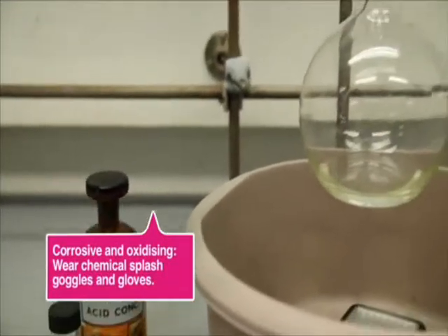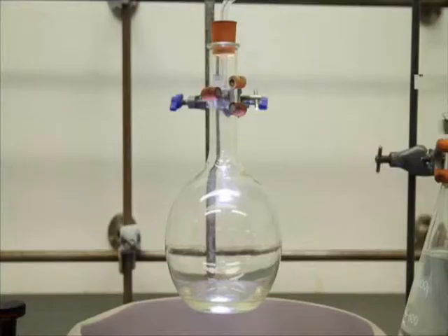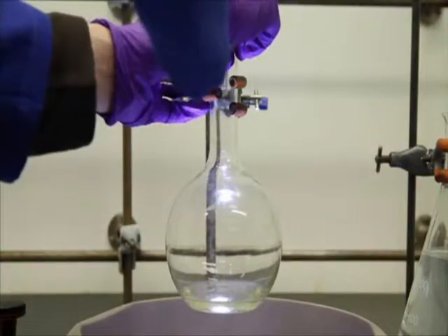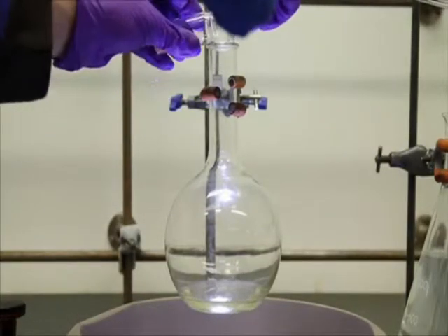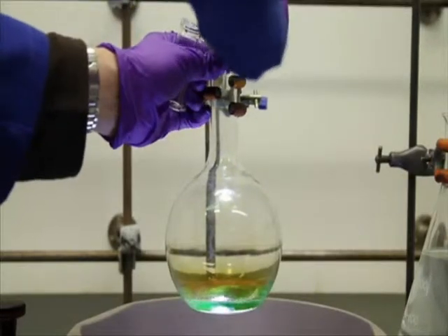40 millilitres of concentrated nitric acid and a 1 litre borosilicate flask. Round borosilicate is preferable as you can see the reaction better, but if you need a thick-walled borosilicate flask, a Buchner flask may be a suitable alternative.